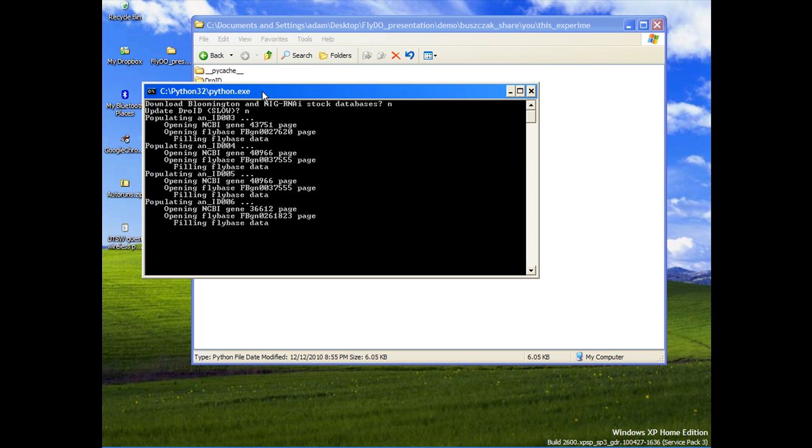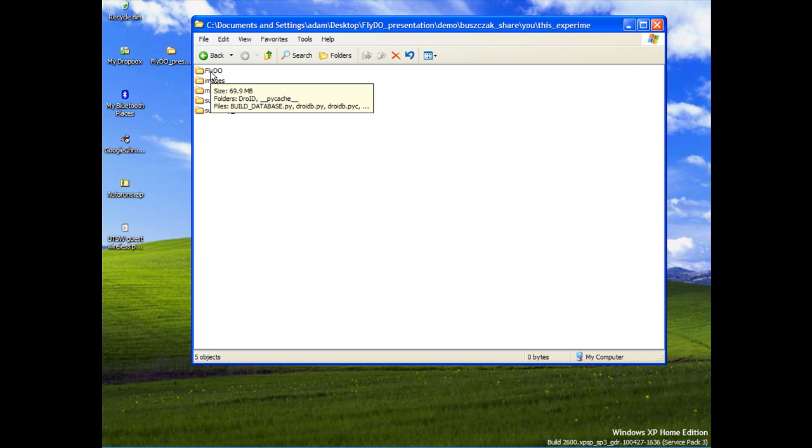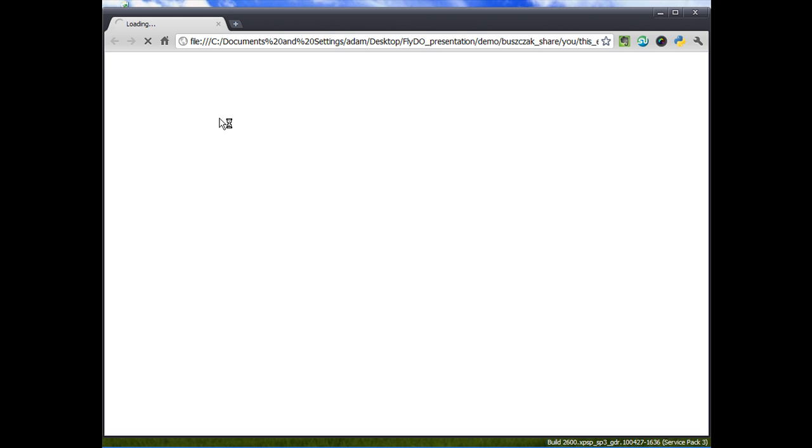And now it should be finished. There. Okay. And it should just kill itself, and that's the end. So now that we've done that, if we were to go back, we would see now a summary files folder, right? And now we can see our 4 HTML files that it built, just like it was supposed to. But there's no index file. So that's the next thing you do: say, I want to make my index. You can see that took no time at all. And now we've got an index file. So if we open this guy up, then you have your completed result.